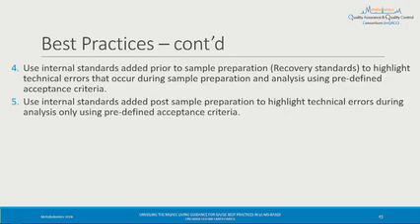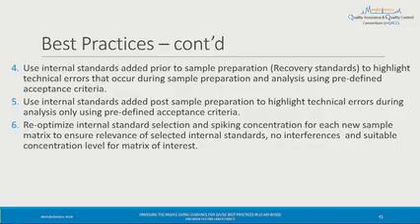If you add internal standards post-sample preparation, then this will highlight technical errors during analysis only, and again, you need to have predefined criteria by which to accept or reject a particular batch or sample.